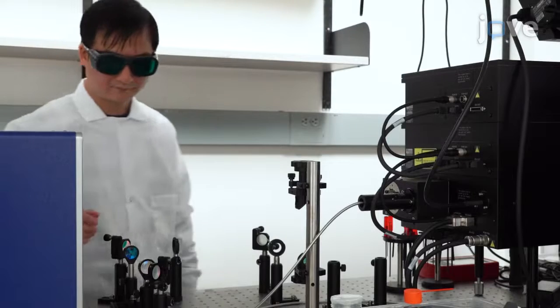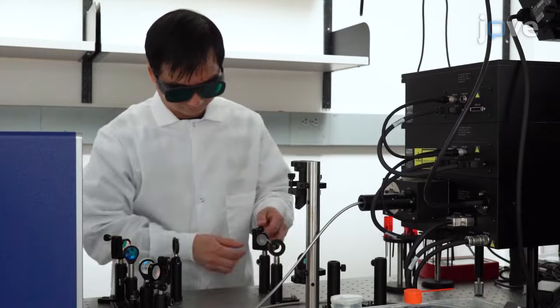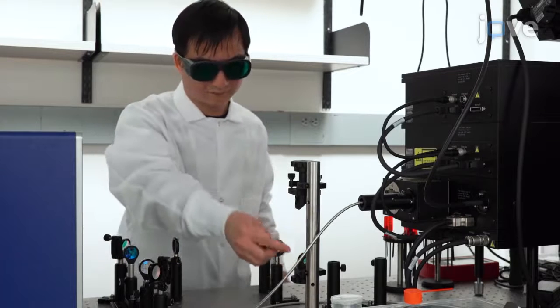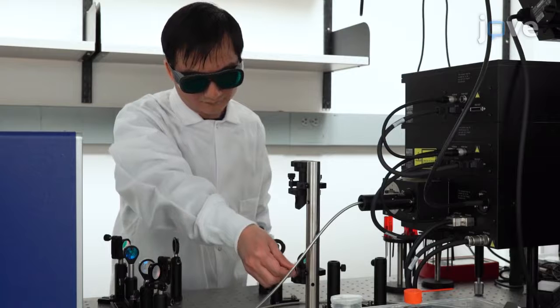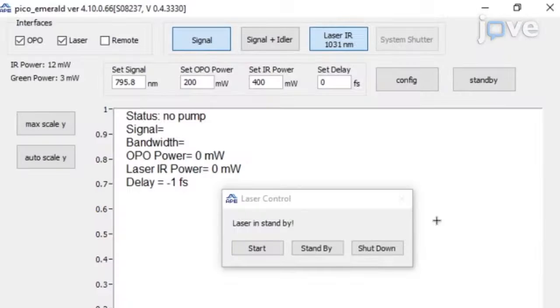To feed laser beams into the SRS microscope, first set the periscope to lift the beam from a picosecond light source exit to the infrared laser input port on the scanner of the microscope, and open the laser control software to start the lasers.